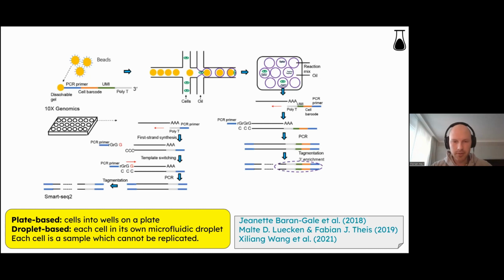One important point, which you can also find here as a take-home message, and which you need to think about for single-cell, is that with bulk, you know that you can do biological replicates. In single cell, that's technically not possible, because each individual cell is unique; in a very short time frame a cell might change its transcriptional composition, and so each individual cell stands for an individual sample, let's say.